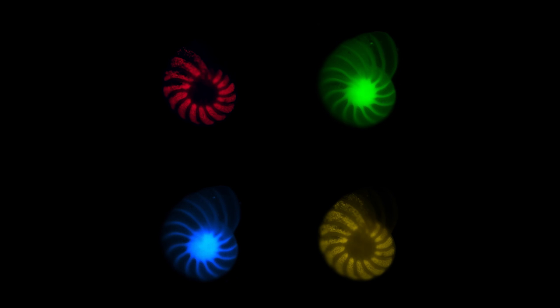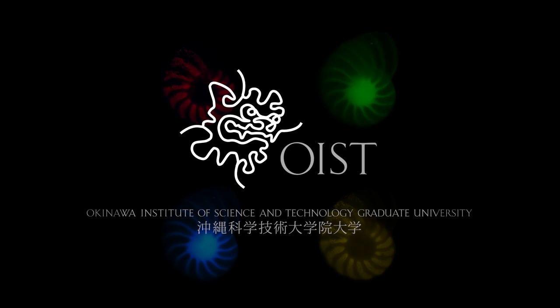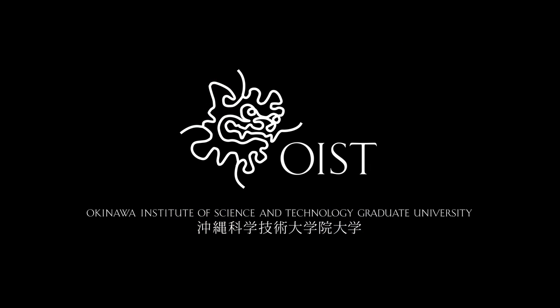When I put it side by side it really looked like this Andy Warhol type of image so that's why I arranged it this way. This organism itself is very beautiful when you look at it under natural light but then with these fluorescent lights, these four different colors which are quite matching well together, I thought this is worth putting it side by side.